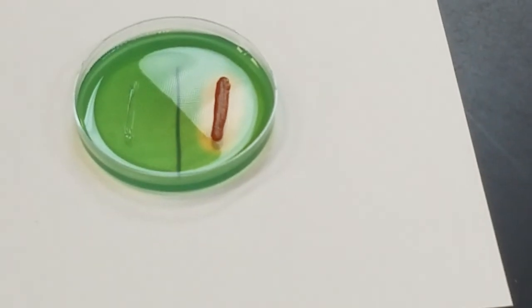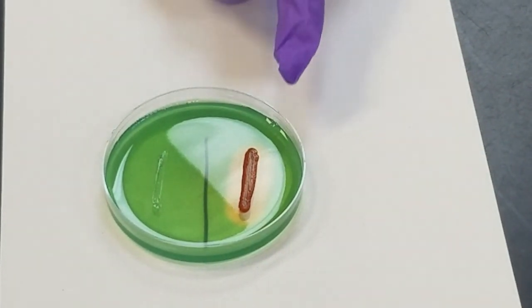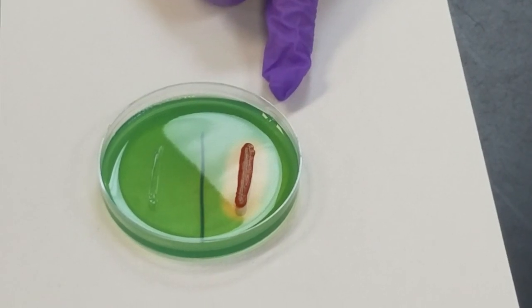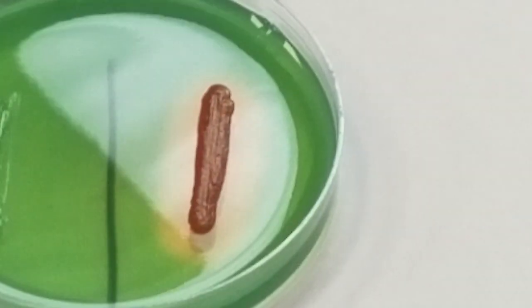To see it better, we can put it on a white piece of paper, and now you can really see the clearing. So this is positive for the breakdown of DNA, of nucleic acid, and this is negative.